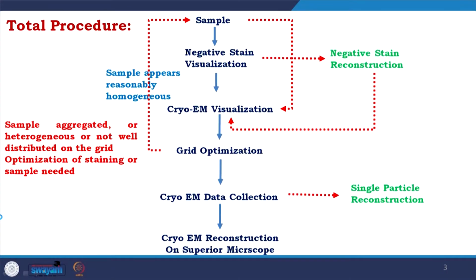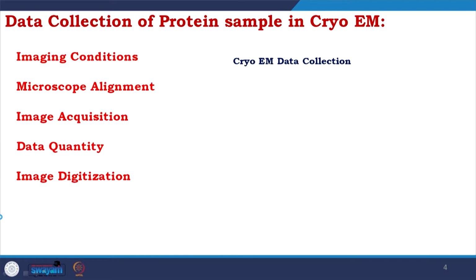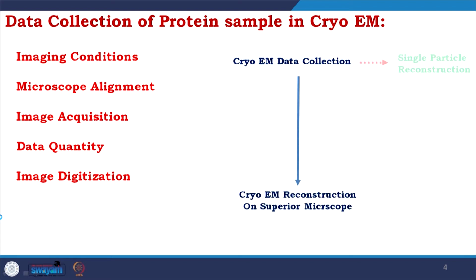From cryo EM data collection you could do single particle reconstruction. So, today as I told, we will talk about cryo EM data collection.